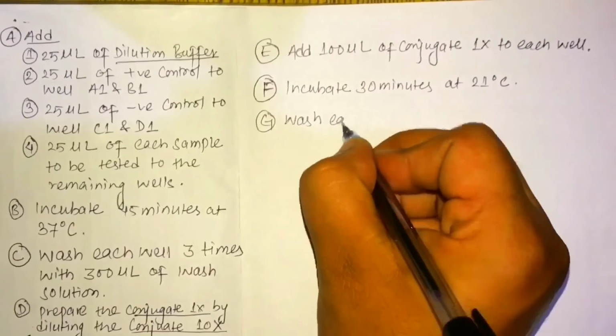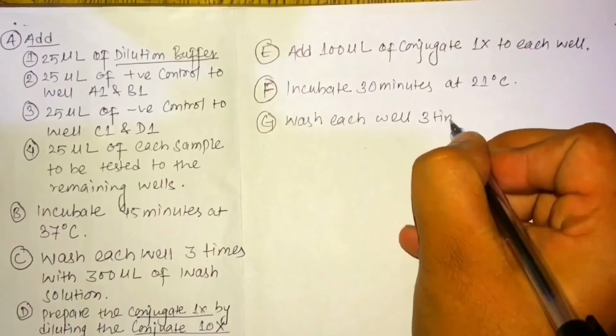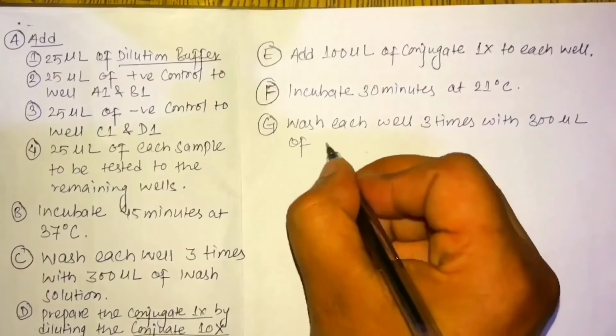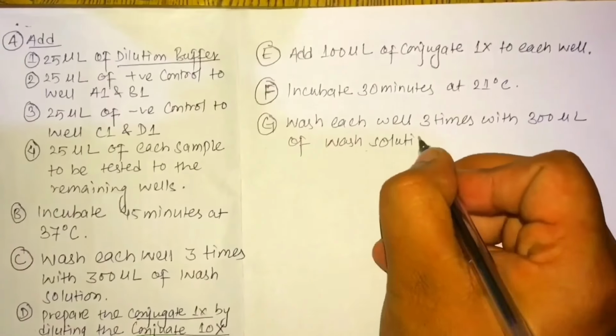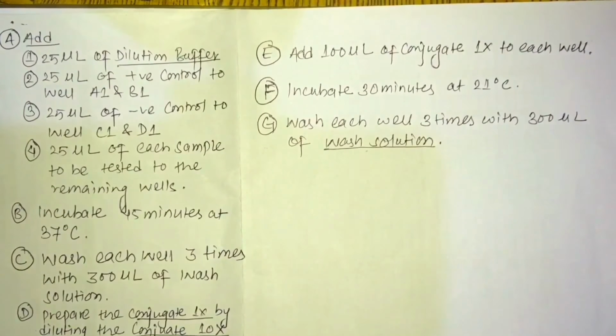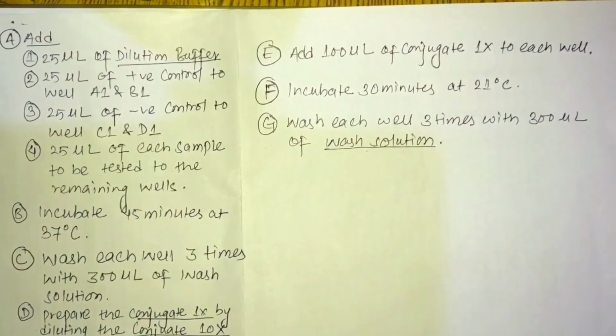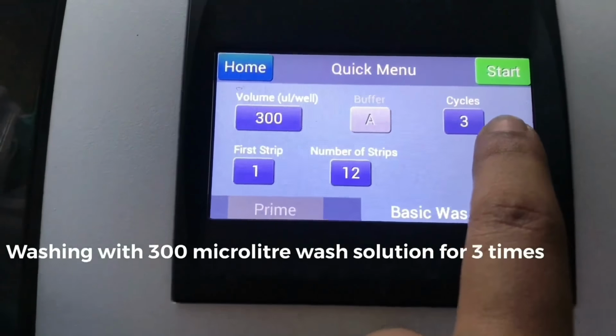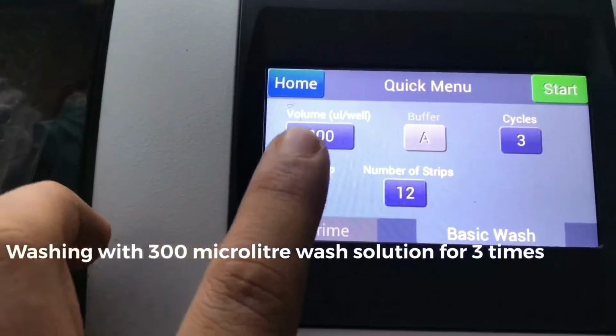Now we will wash each of the wells 3 times with 300 microliter of wash solution, like the previous washing, a similar procedure. The wash solution is provided in the ELISA kit, but we are using the automated washer, similar 300 microliter, three cycles.